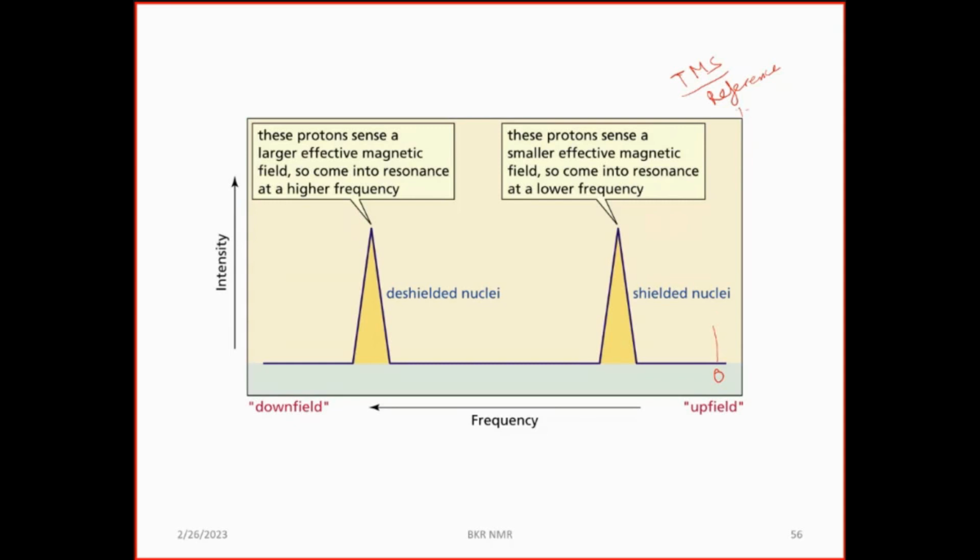But as I told you already, there are some other molecules which can have a value lower than this. There are molecules like methyl lithium that I told about. So it can have a value lesser than this 0. It can be on the negative scale. So why don't I choose them as the reference?